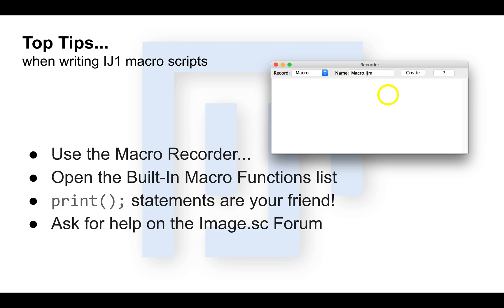One day this will be automatically open, but for now you have to open it yourselves. Next, open the built-in macro functions list. If you are scripting in the ImageJ1 macro language, have this page open and ready. It is obvious that you cannot remember all the function calls you'll need, so you will have to search. It's a macro scripter's best friend.